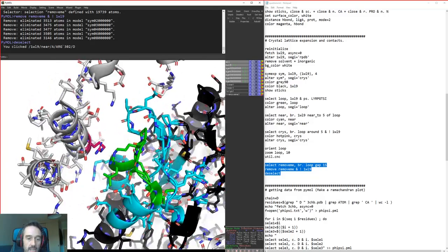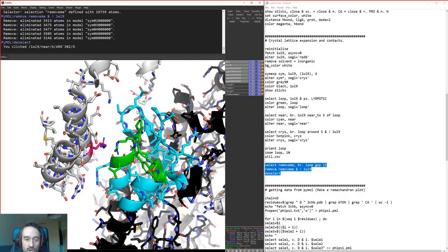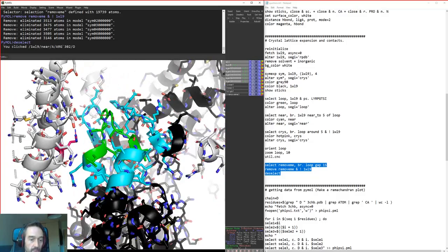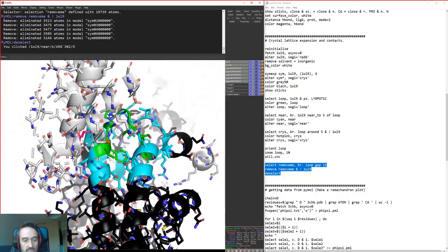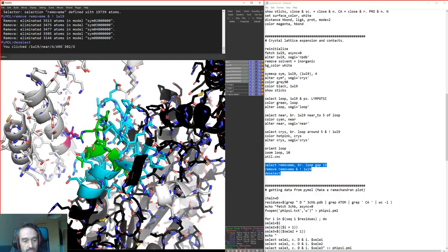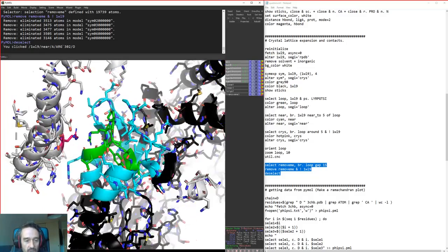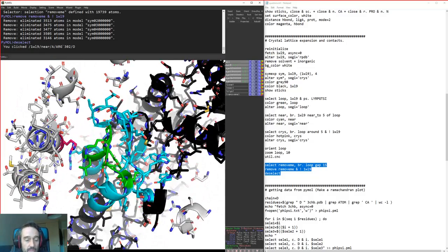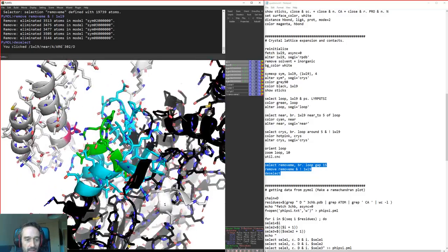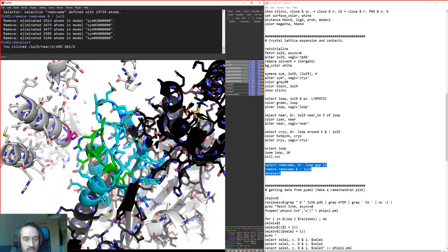And we've identified a bunch of residues in blue here that are within 5 angstroms but are part of our asymmetric unit as well. So maybe I was interested in designing 2 alpha helices that come together in this particular geometry, and I was looking for loops that I could model into my alpha helices, and maybe I'm looking for loops that are exposed to the solvent and therefore aren't reinforced by local interactions. And this is a way of finding out that maybe this particular loop is not a very good example of one that I could use for my design, because it seems to be very much reinforced by local interactions and by crystal interactions.